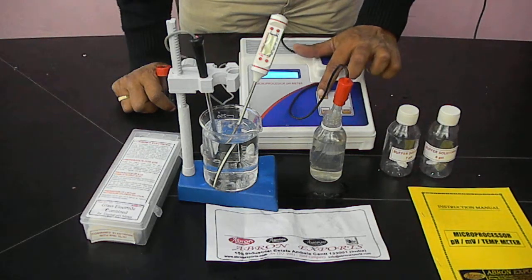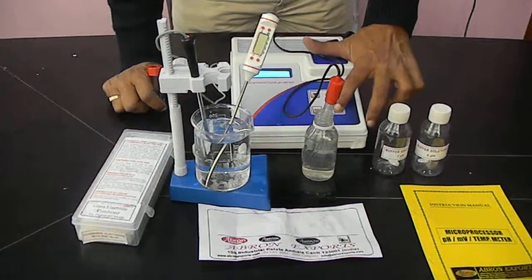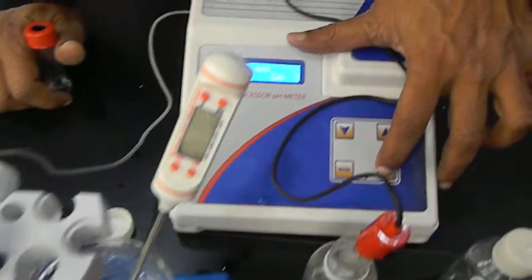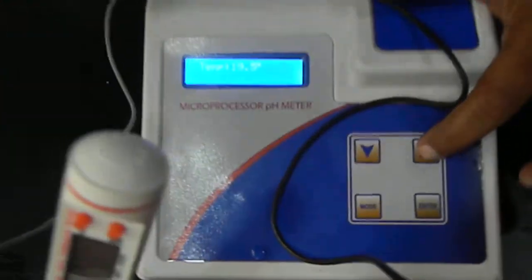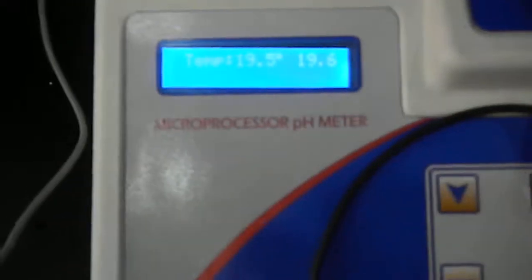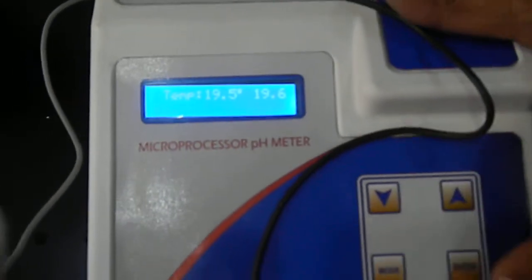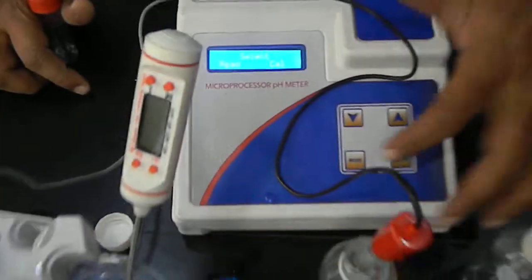Let us say I am setting the temperature. I have selected this temperature — there is a cursor below. Enter this for calibration. I select calibration again, enter it, and there is 19.5 showing. I can change it — we have seen this is 19.6 or 19.5. We can change it, then enter it. This temperature is already set. Now the temperature setting is done.